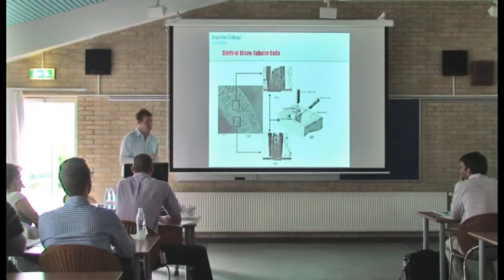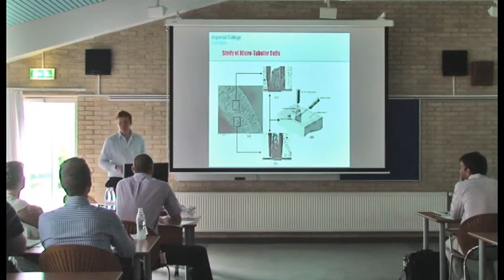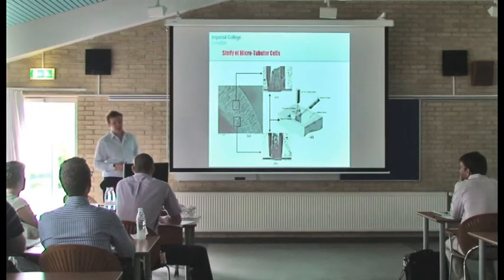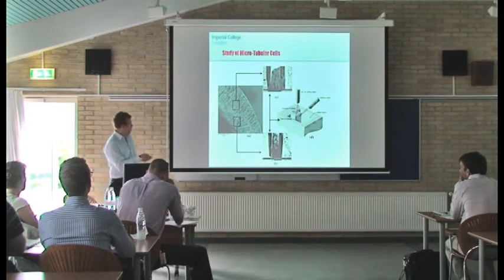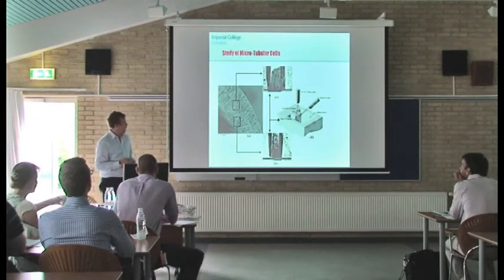And then the last couple of applications of focused ion beam I'm going to talk about are the way we've combined these with modelling studies. So first of all, we looked at some microtubular cells. The Imperial College group of Jeff Kelsall is looking at novel phase inversion techniques for manufacturing microtubular cells. These have highly distributed structures depending on their position within the cell. So you get these large finger-like pores which are supposed to accelerate gas diffusion, and then you get electrochemically active regions which are supposed to promote electrochemical activity.